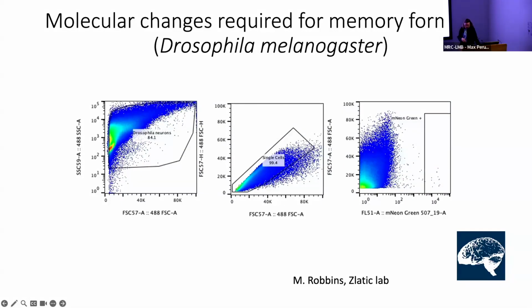Her project involves determining whether different dopaminergic neurons and their postsynaptic cells involved in reward learning have different naive transcriptomes, so before learning. She wants to help understand how this complexity of molecular signaling can occur in the circuit, for example, how many transmitters or receptors, and some sensitivity to calcium. As I mentioned, it's quite challenging, first and foremost from a sample preparation standpoint upstream of bringing them for sorting.